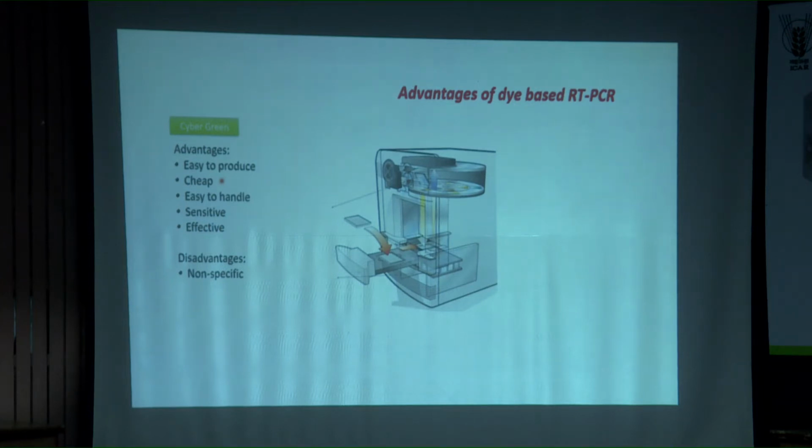And this fluorescence is captured by the so-called spectrofluorometer. In a nutshell, your qPCR is nothing but a normal PCR where we added something to decorate the DNA, and the decorated DNA is monitored by a camera, that is called the spectrofluorometer. Accumulated dye is monitored. Try to understand that. Let's move on to the next one.